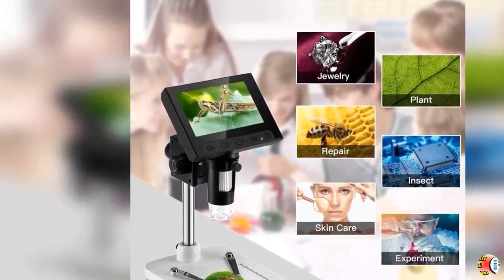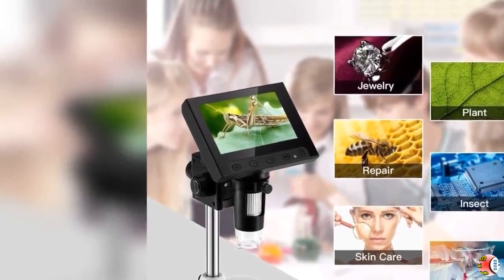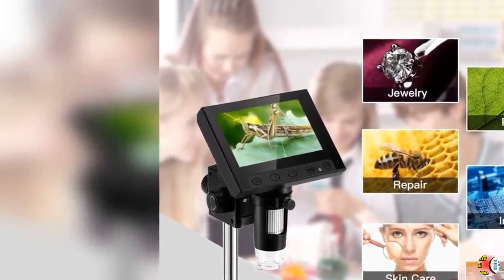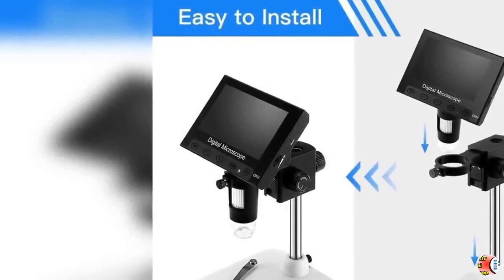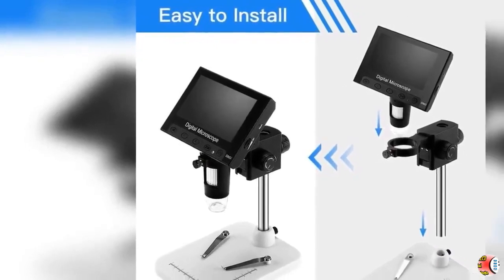Feature 3 — Dual Power Supply: Powered by Li-Ion battery with 6 hours work time, or USB. Truly portable and independent. The LCD microscope is detachable, which enables field observation.